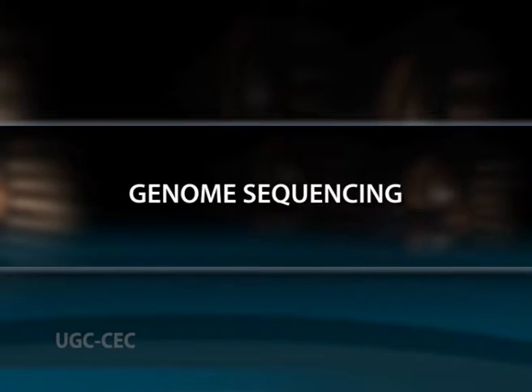Genome sequencing. Sequencing is the first step of structural and functional analysis of a newly determined sequence. The importance of sequencing is increasing to find the interface between a new protein and the one which already exists. DNA sequencing commonly refers to the methods used to determine the order of the nucleotide bases in DNA.